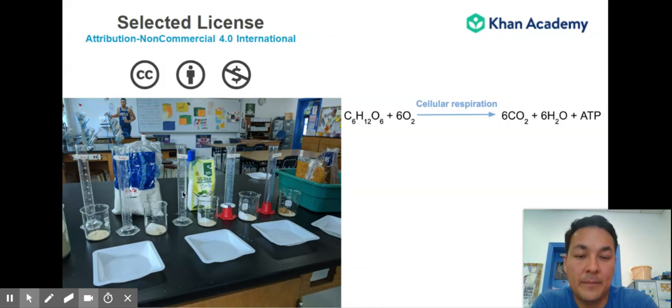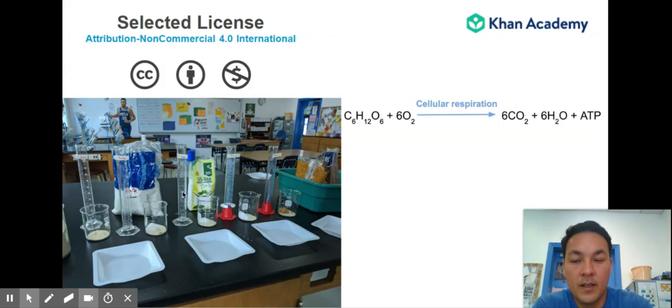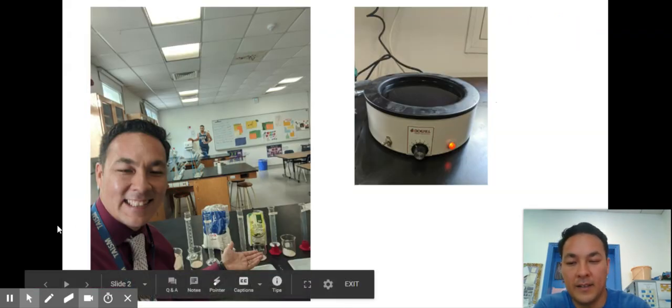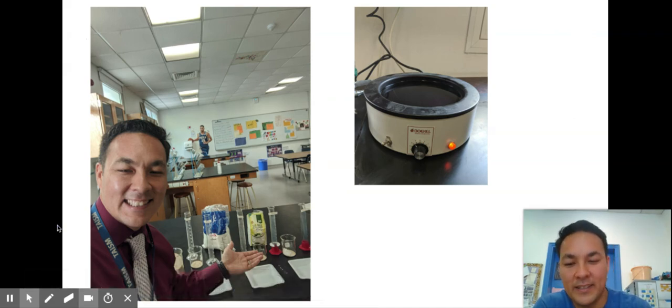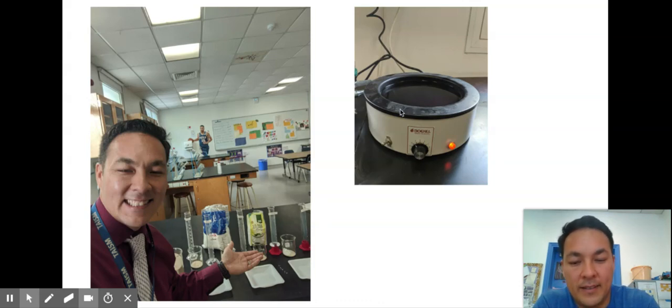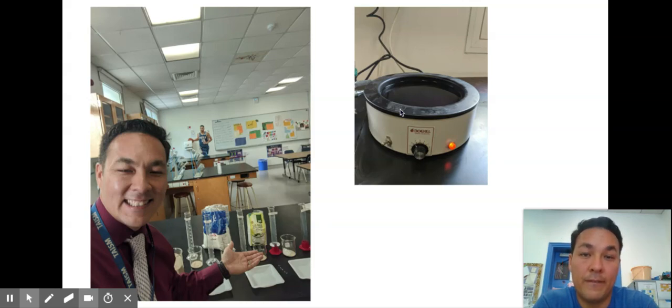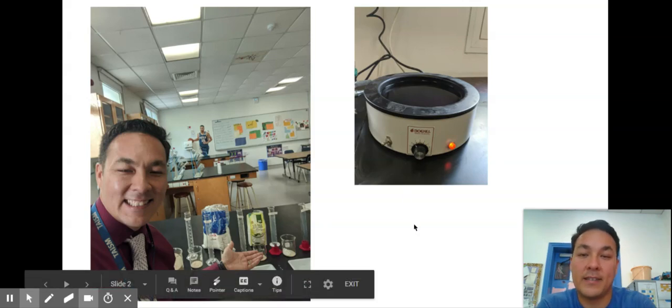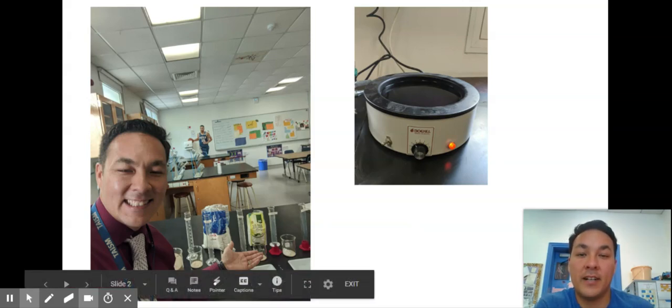If you wrote about either or both on your lab, that's great. Here I am wearing a tie on parent-teacher conference day — here's my setup. I did a bunch of different sugars with the same amount of yeast and warm water from the warm water bath, using similar graduated cylinders. I was trying to see which sugar promotes the greatest fermentation or the most carbon dioxide produced. You might have tested pollution, different amounts of yeast, different temperature, or the water — there are a lot of different experiments you could have done, and in class this week we'll share those.